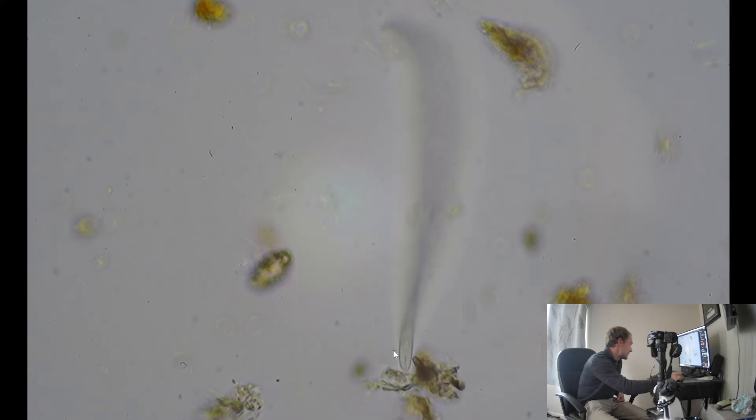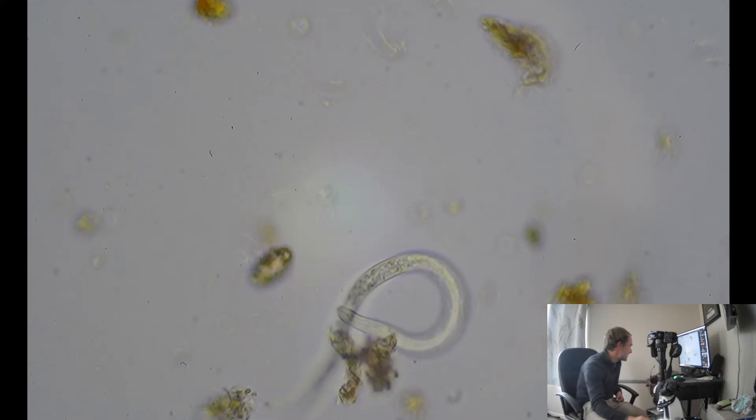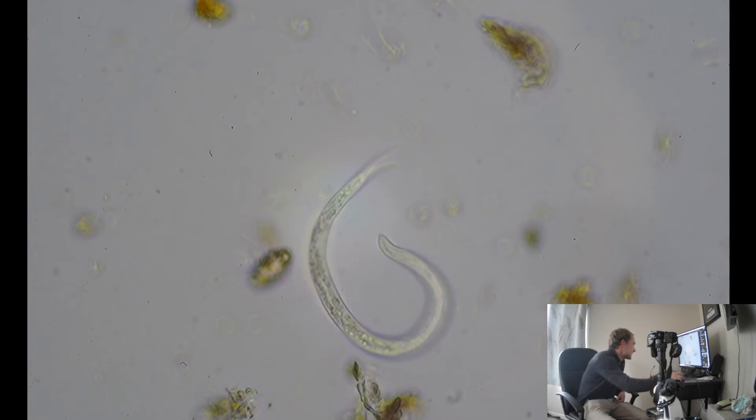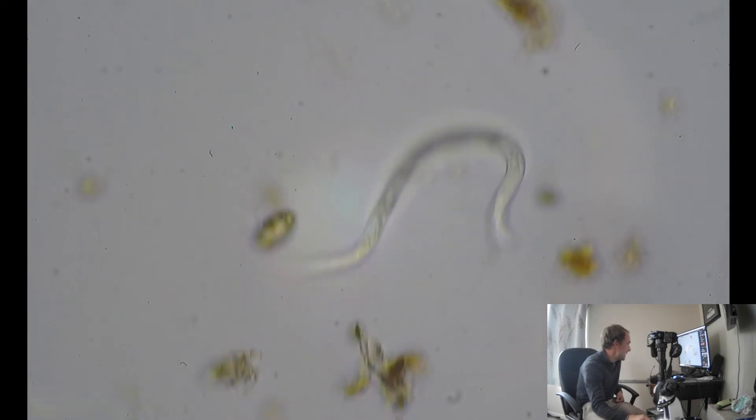Where's my mouth? Right there. I think that's what he uses to... I think that looks like he has a bunch of stuff floating around them, so it could be bacteria in there.